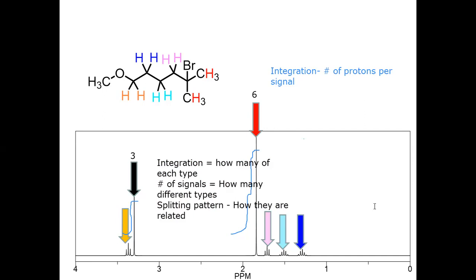It's like a closed system, and you don't have to fill it as often. At least that's the theory behind it. You still lose some helium, but they make these closed systems where the helium just continues to recirculate without needing to be refilled. Even so, you have to refill it at some point. It's called a low boil-off magnet, so the amount of helium that boils off or is released is much less.